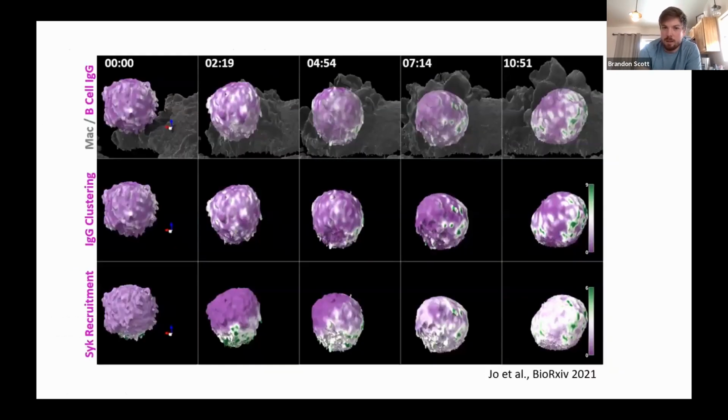And so what does that look like then? So now if we can start to show our surface renderings in a different way, this is now quantitative, but getting to the point of a graph is actually still quite difficult, because we're still left with the fact that we have a four-dimensional object, 3D over time, and trying to show that as a plot becomes very challenging, because what is the question that you're trying to ask?